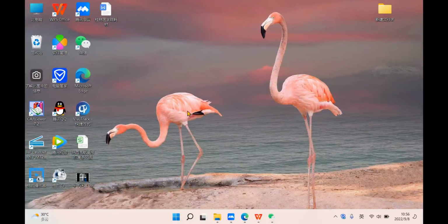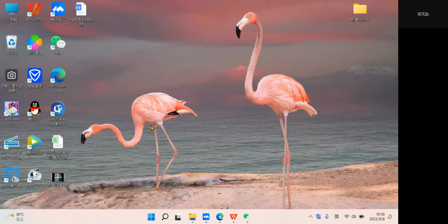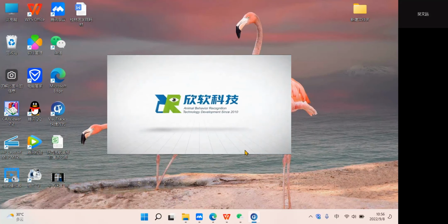Hello, everyone. Now I will demonstrate how to use our behavior analysis system software VisuTrack. First, we open our software on the desktop. Click this icon.